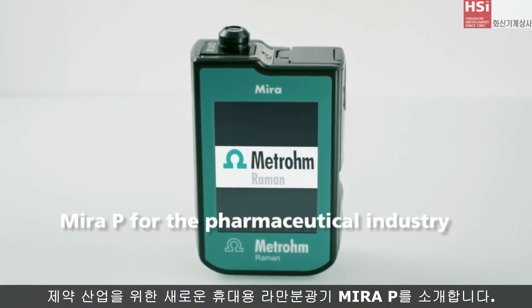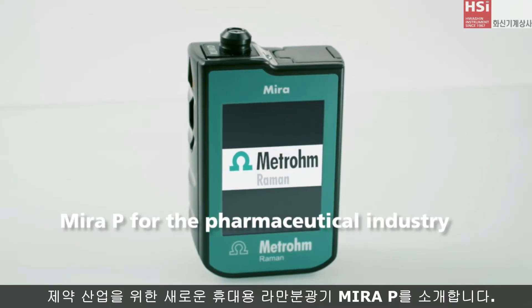Introducing MiraP — the new handheld analyzer for the pharmaceutical industry.